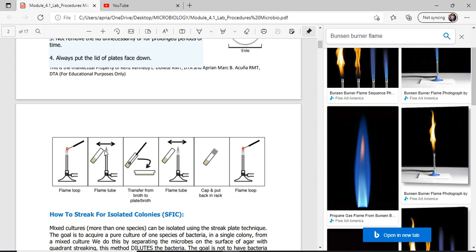To ensure nga wala sang magwa nga aerobic, ang airborne nga bacteria, mapatay siya sa flame. Not necessarily nga ibutang mo ang tube mo sa kalayo, but close enough sa flame. Then you have here ang imong ginpainit nga loop.